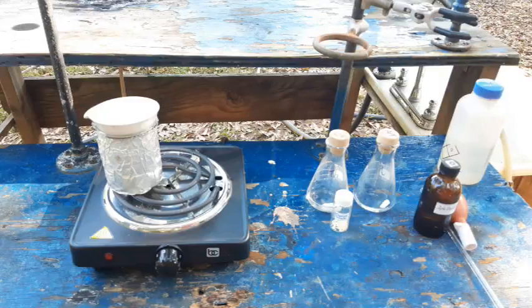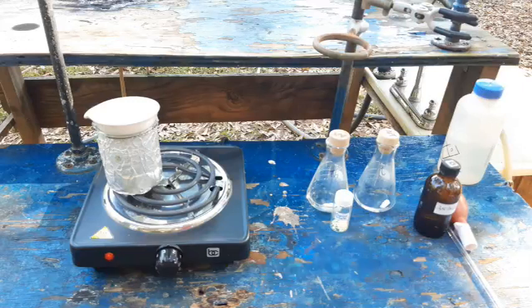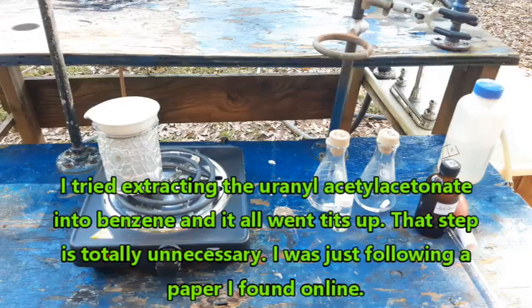Hello everybody, and welcome back to the Poor Man's Chemist. In this video, I am going to be making thorium and uranyl acetylacetonates. I've already made uranyl acetylacetonate once before, about a year ago, but the prep was not satisfactory, so I want to repeat it and do it better. I also want to make the thorium complex, which I've never seen before.